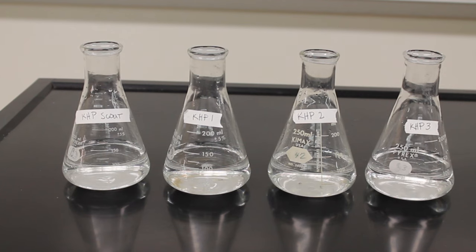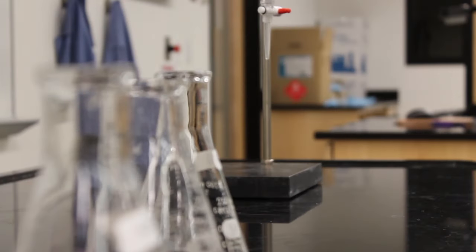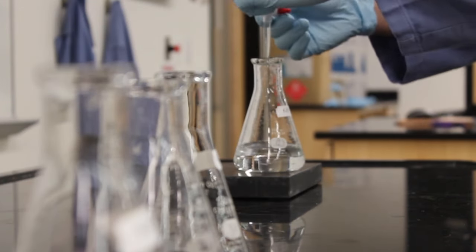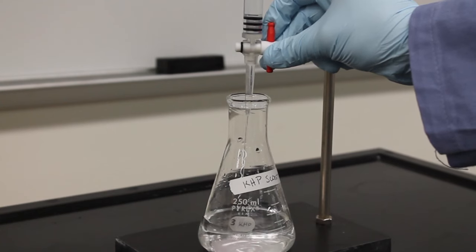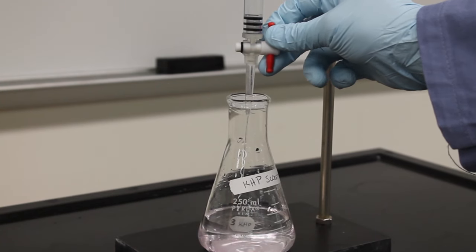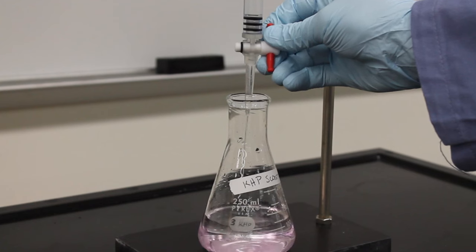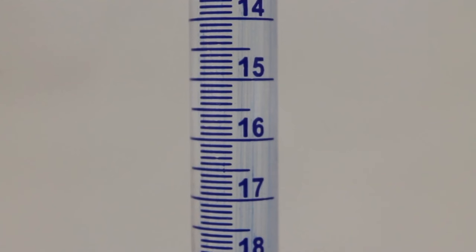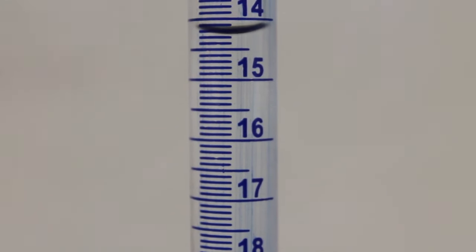A scout titration is completely optional. This titration is typically done pretty fast, and it does not need to be super precise. The point of a scout titration is to get a rough estimate of about how much titrant you are going to need to add to the rest of your solutions. A scout titration will only be valuable if the masses of KHP are close to each other.